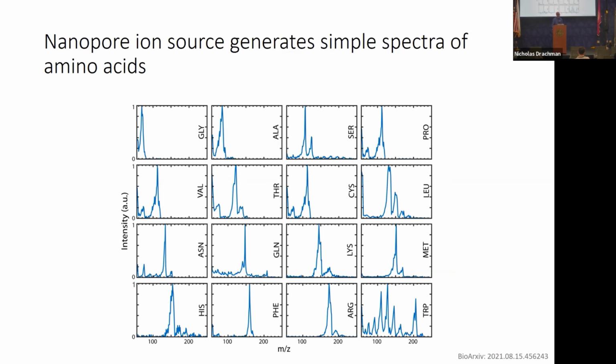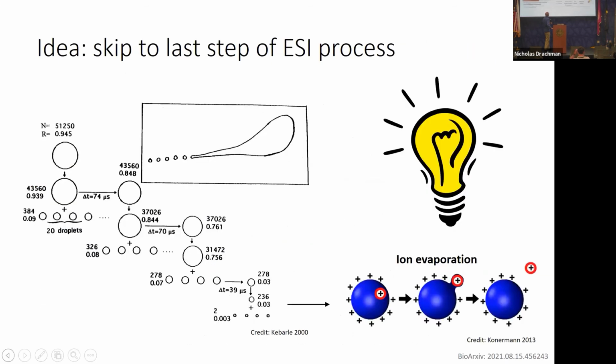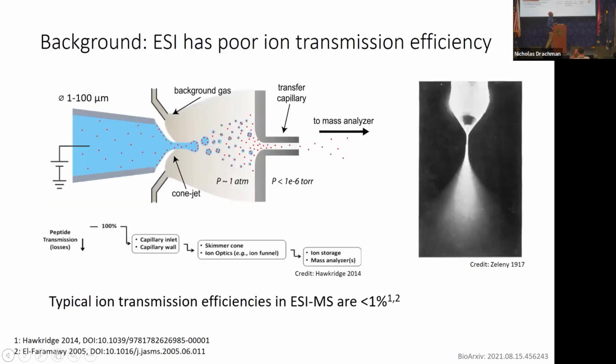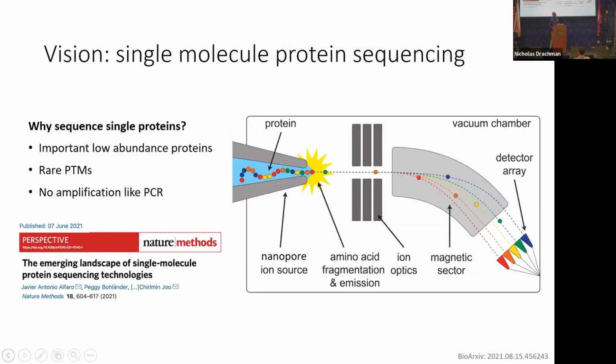How do you push this thing in? Because you said you push in, but there is no chromatography, nothing. How do you actually push them in, and what was this colored yellow thing in your picture, how do you separate amino acids? If you go back to the picture where you show how a single amino acid is detected here, what is that yellow thing? Yeah, so that's supposed to represent basically the fragmentation.